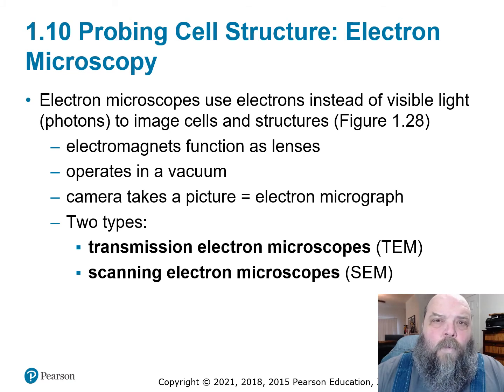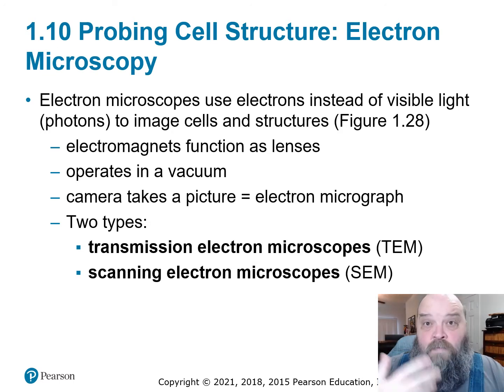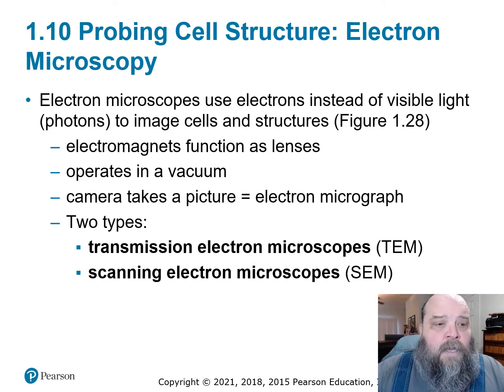Now, what do you do when a light microscope just does not have the magnification you want? You can only take a picture from a light microscope and increase it so much with a computer before it just gets too fuzzy. Well, first, get rid of the light bulb, go to a laser like we talked about with the confocal, and then you just get rid of the microscope and the lenses altogether.